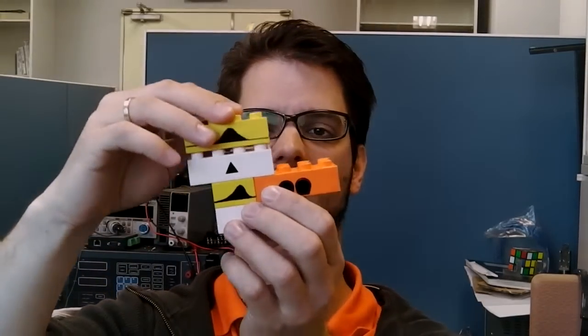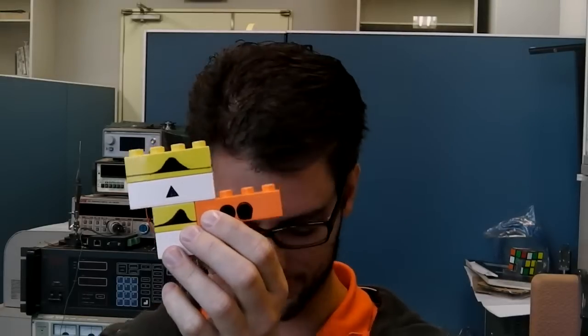For example, they've made a model starting in sort of the right way, starting with sphere-like particles and combining it with a Weibull distribution and a hard sphere structure factor. But since that didn't quite fit the data entirely, they also added the pyramidal form factor combined with a Gaussian size distribution and a fractal structure factor, because that seems to be all the rage these days. Now, of course, a function like this might fit your data, but this model might not be so applicable to the actual system that you have, because there are an infinite number of models that will fit your data, and you've just found one of them.